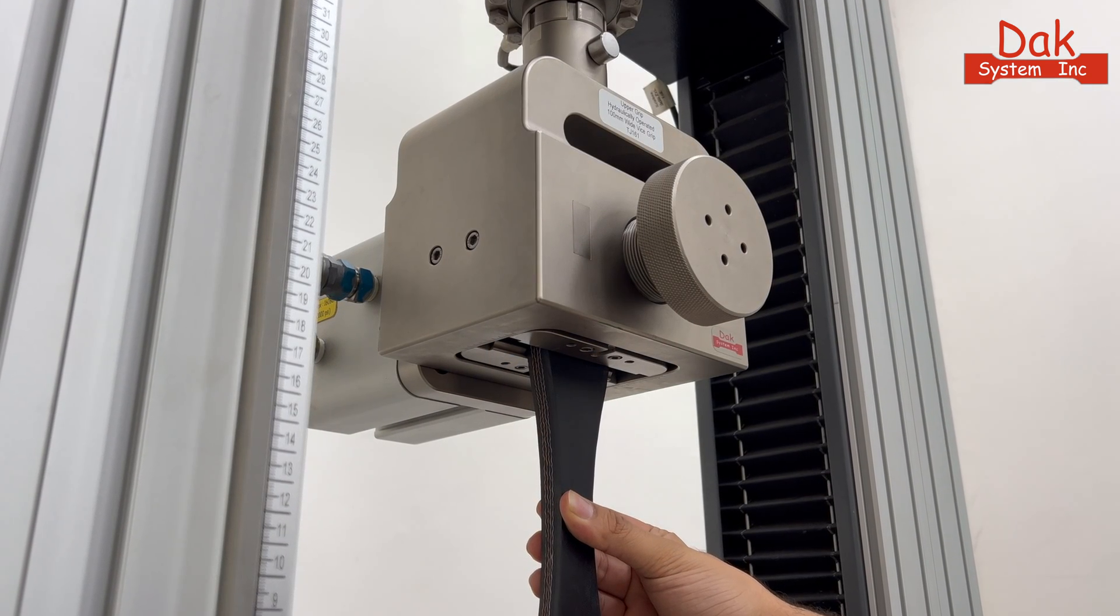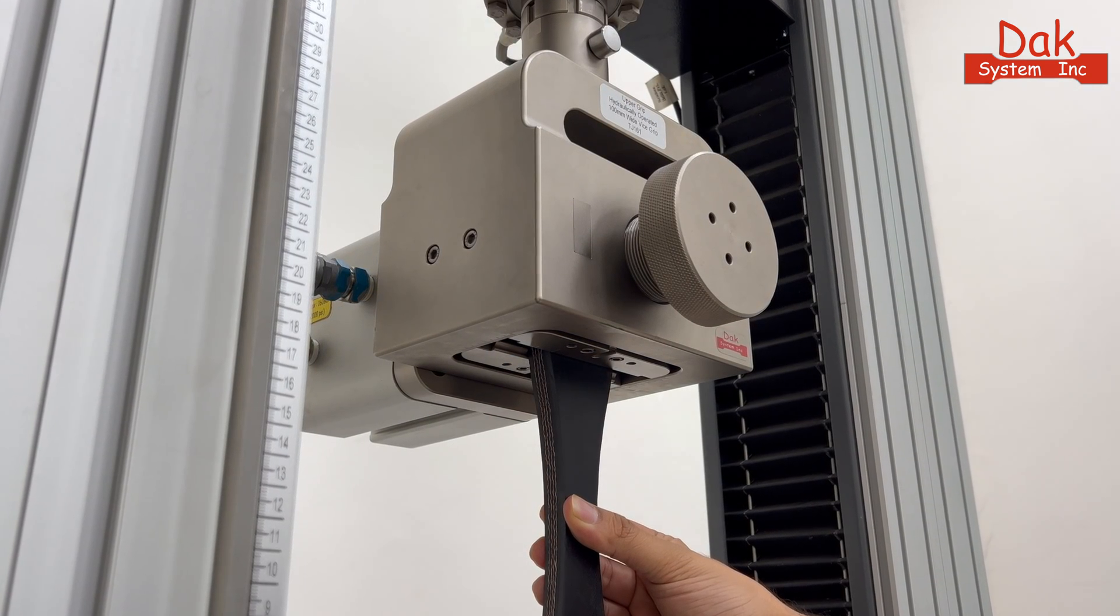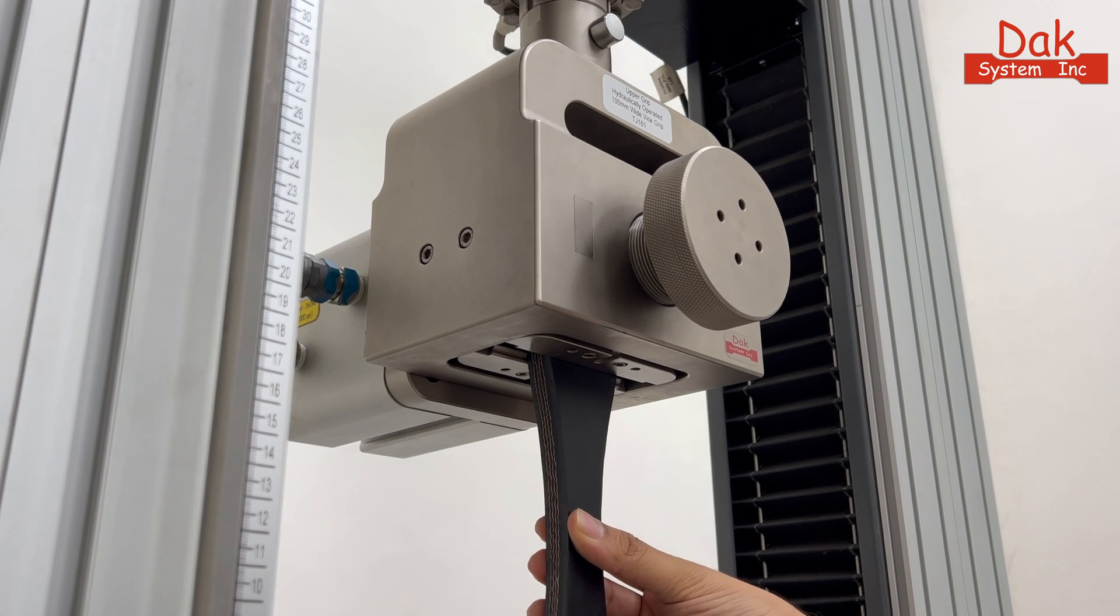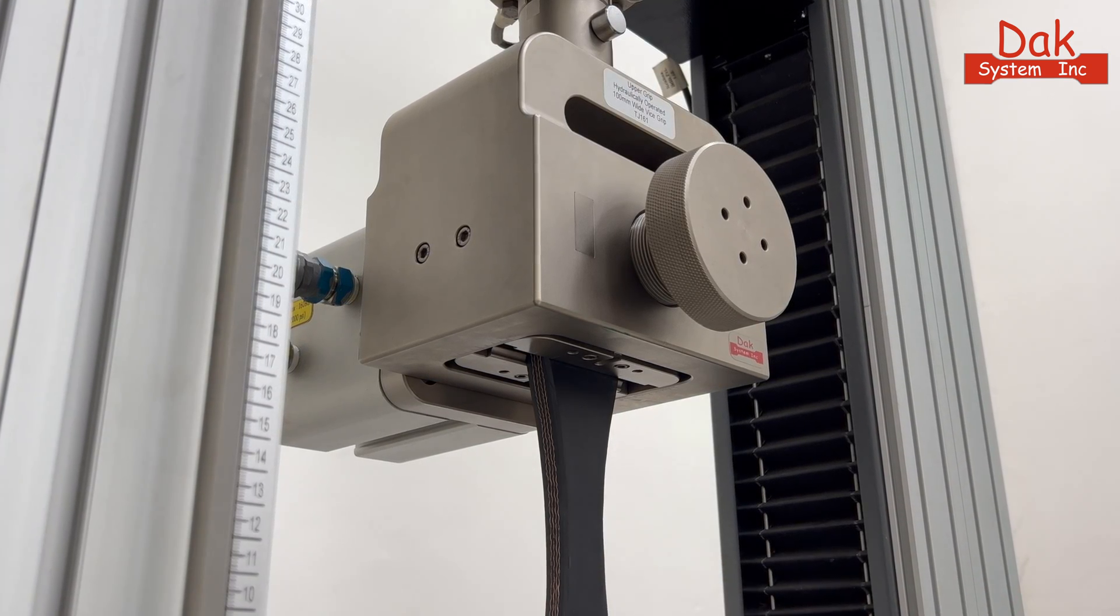Our method employs hydraulic vice action grips, effortlessly activated by a foot switch.